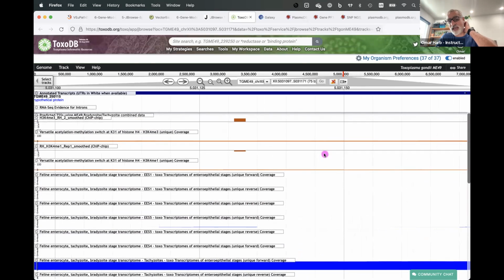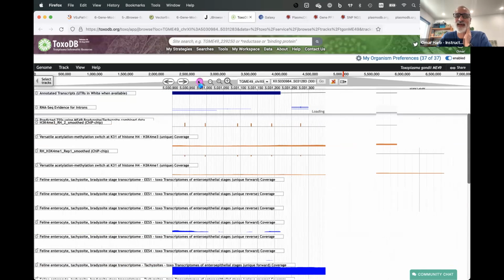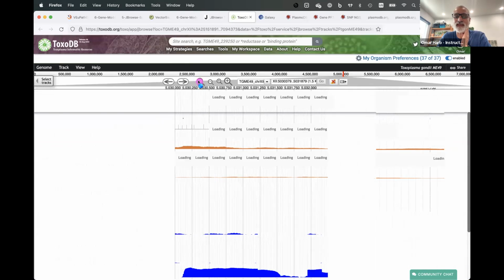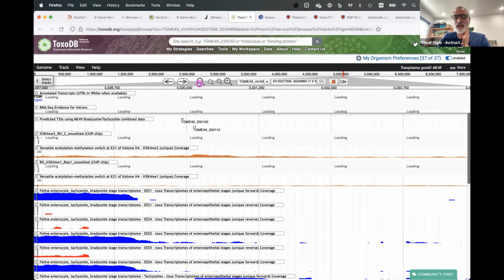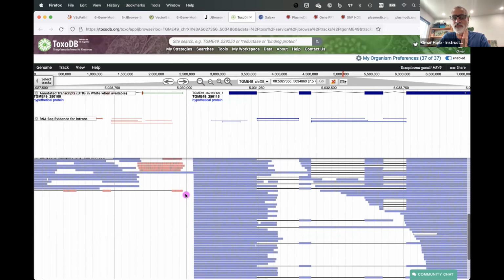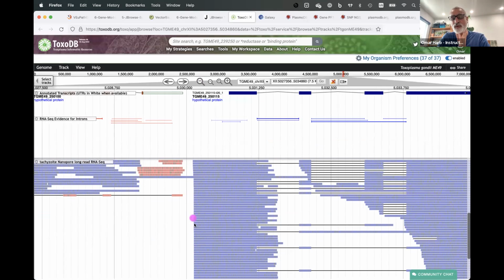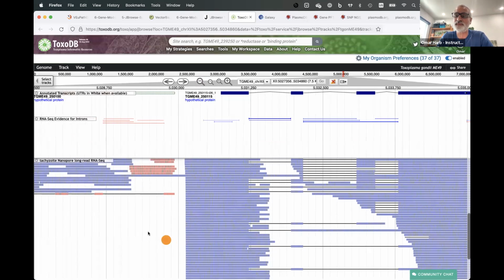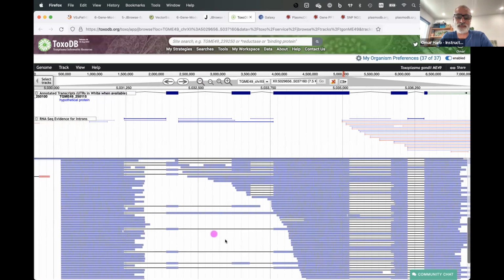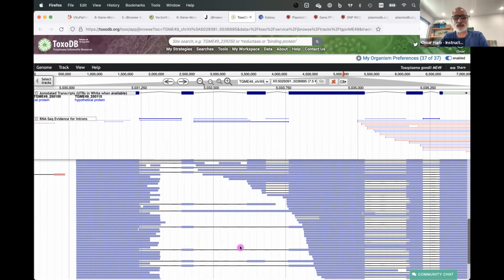That said, as Catherine indicated, this could actually work to our advantage in this case, specifically for looking at the 5' end of the gene, because maybe that weird priming allowed the sequence to be much more accurate right here, giving you many more reads, and this is telling us that that's really the correct 5' end of this gene. That's really good to know. I always forget about the 3' bias of this data.